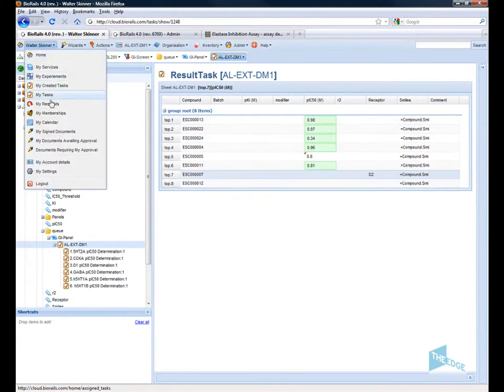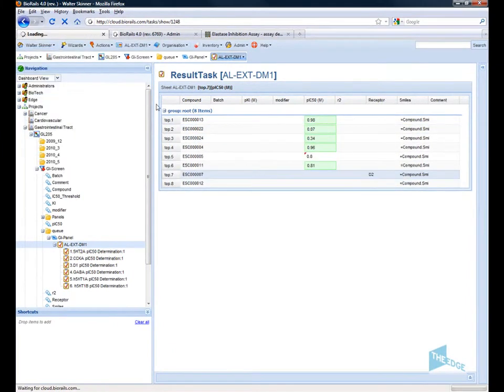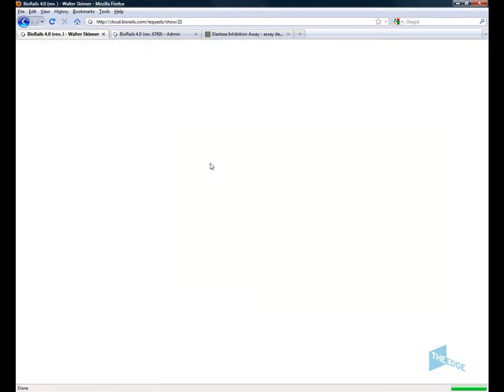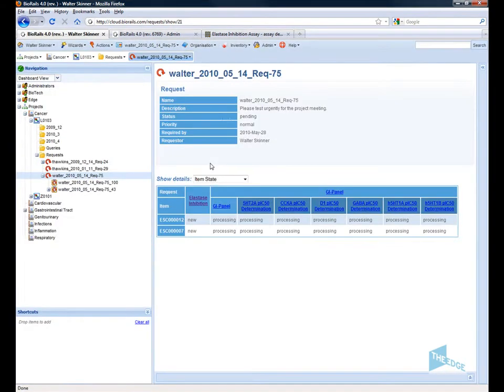Now if I go back and review my requests. I can see my request. I can now see that the GI panel items are now in process.